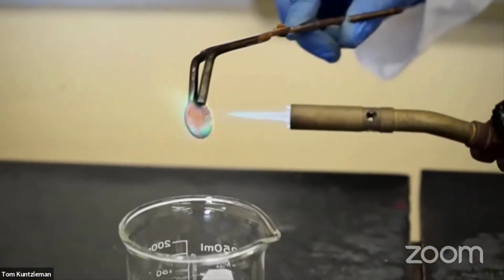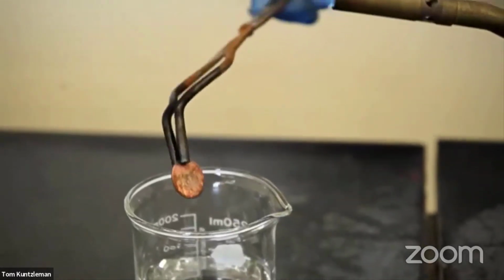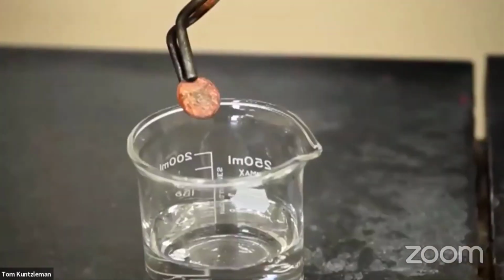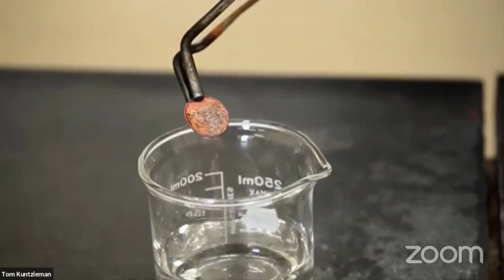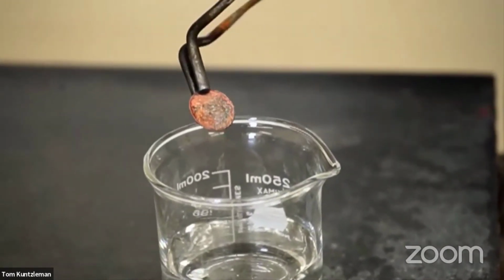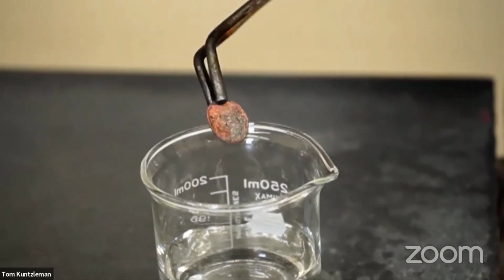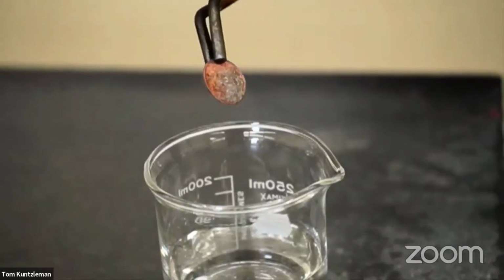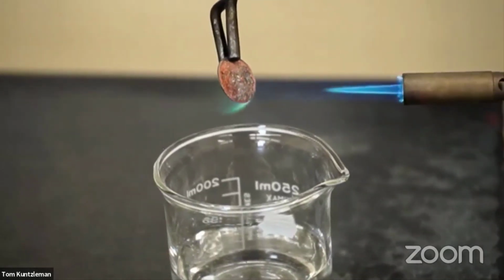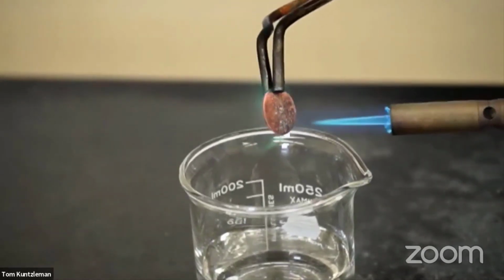That really tells me there's a bunch of copper there. Look at that. I don't know, folks. You may be able to argue that that's kind of gone back. Maybe that's going back to the metal. We'd have to do a careful analysis of that. I honestly don't know. It's potentially possible. I think this is a zinc penny. I think it's going to melt. Let's find out. Look at that green.